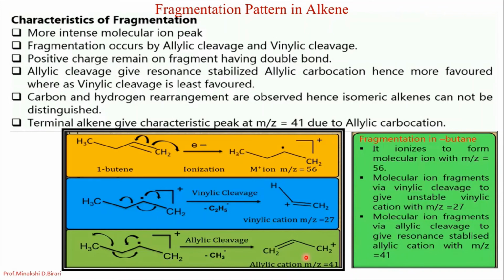So the peaks are observed at M by Z 56, 27 and 41.